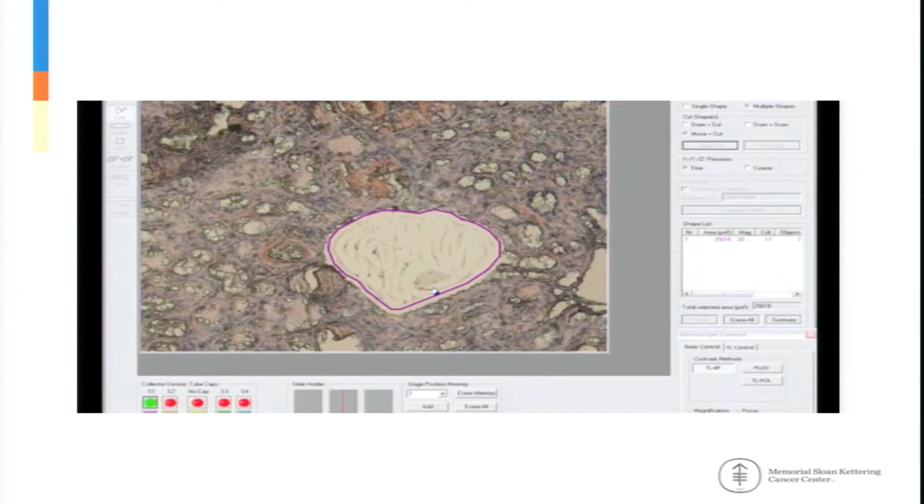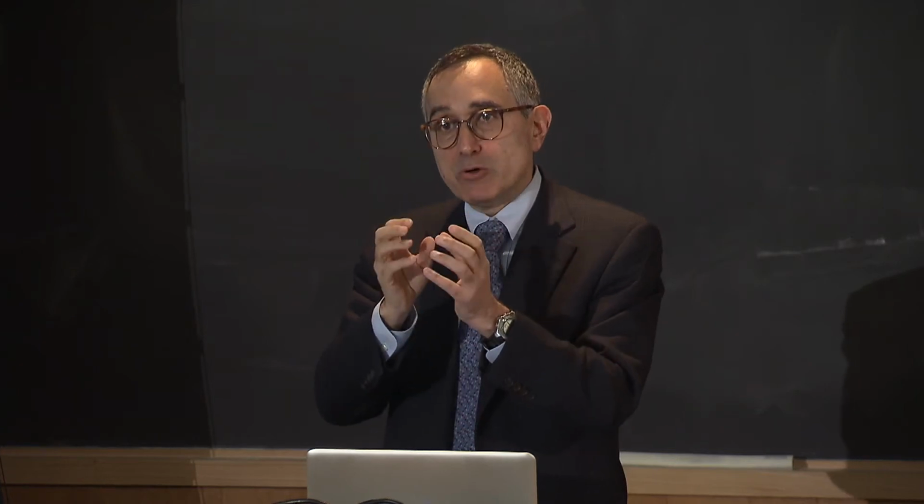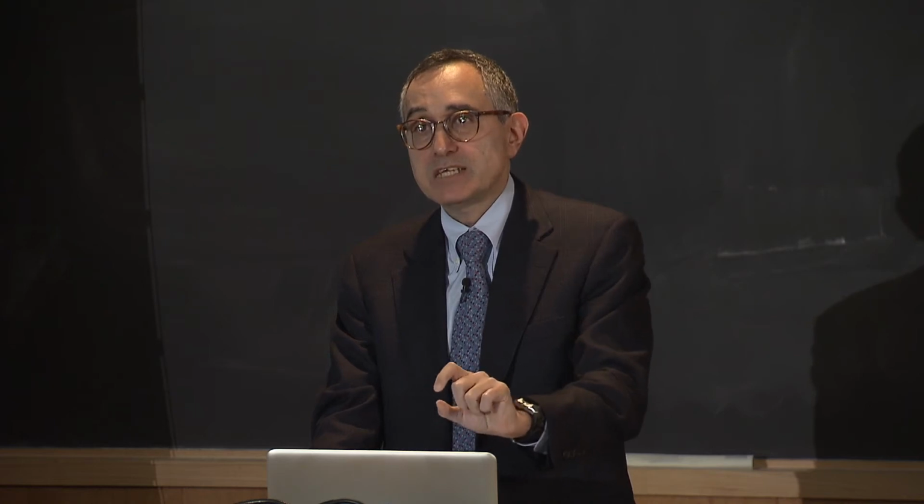We are putting in a relatively pure sample, but also analytically, because you don't have so much information. Without that, I think this would not be possible. People have done this in the past, and the technology was available. If you put the whole kidney in there, for example, you are going to get so much information, it's going to be meaningless. So this was really the major strength of our approach: the microdissection technology at that point had come to a point that we could have this kind of precision.